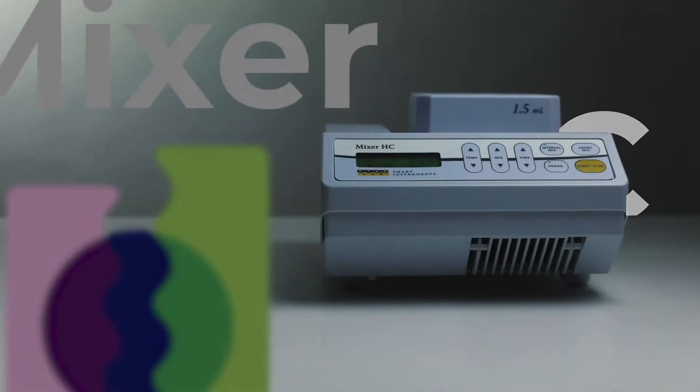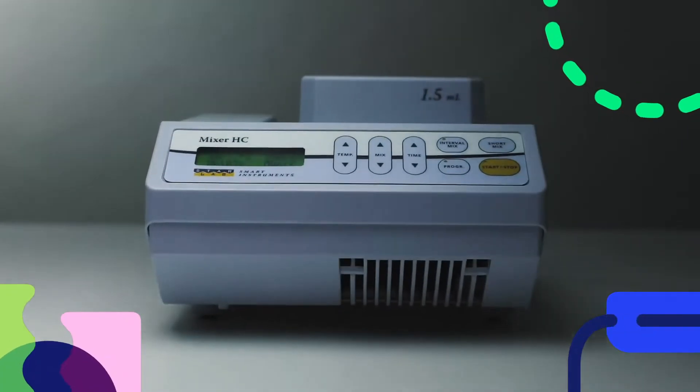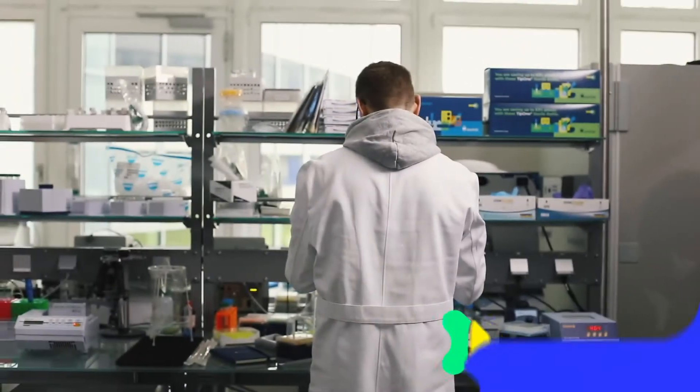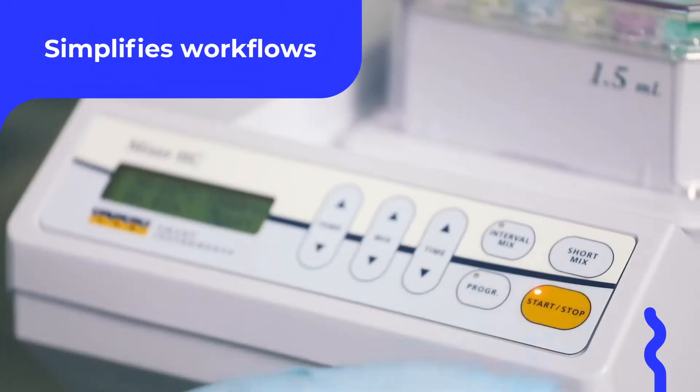This is the Mixer HC, a smart product that simplifies your work in the lab. Our solution makes efficiency in the lab accessible to everyone. The Mixer HC can save you time and simplify your workflows to make your day in the lab more efficient.